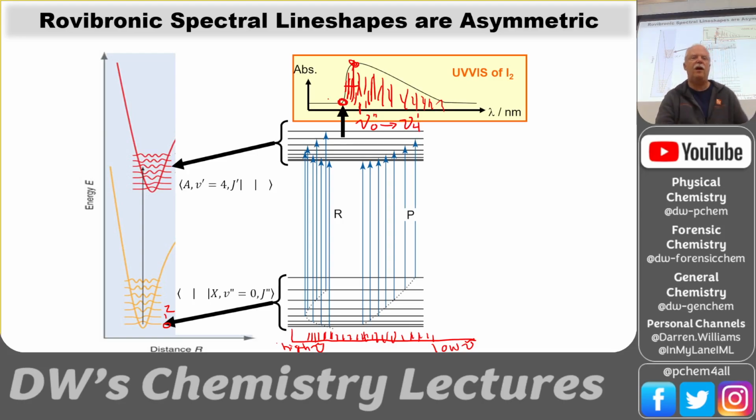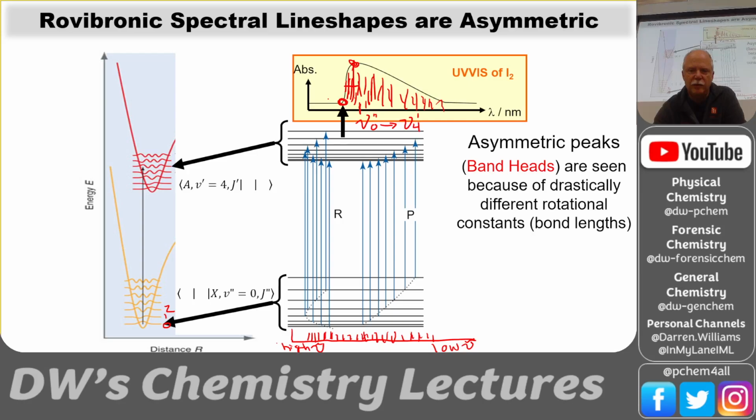In the peak picking, we're not going to pick the maximum of these peaks. They've analyzed this both ways, and so I'm just saving you the problem of doing the lab twice and seeing which one's more accurate. So in the past, they would do this lab twice, pick the peak maxima, come up with your constants, and then pick the minimum on the short wavelength side. Okay, so what we're going to do is pick the minimum on the short wavelength side right here where this black arrow is. And we're going to analyze those positions, and we're going to get more accurate data.